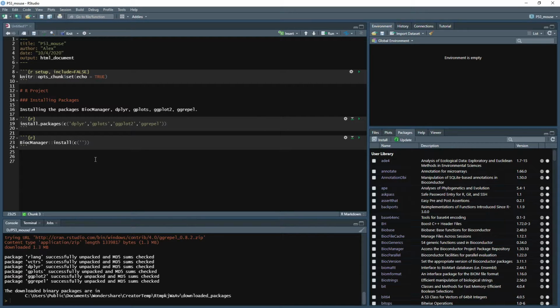So here we have to install a bunch of them actually. So I'm just going to copy and paste what I had written out before. So copy, paste. So we have to do limma. That's going to be kind of a differentially expressed gene package. There's also edgeR, which we cover on the website for iDEP. DESeq2 is another one.